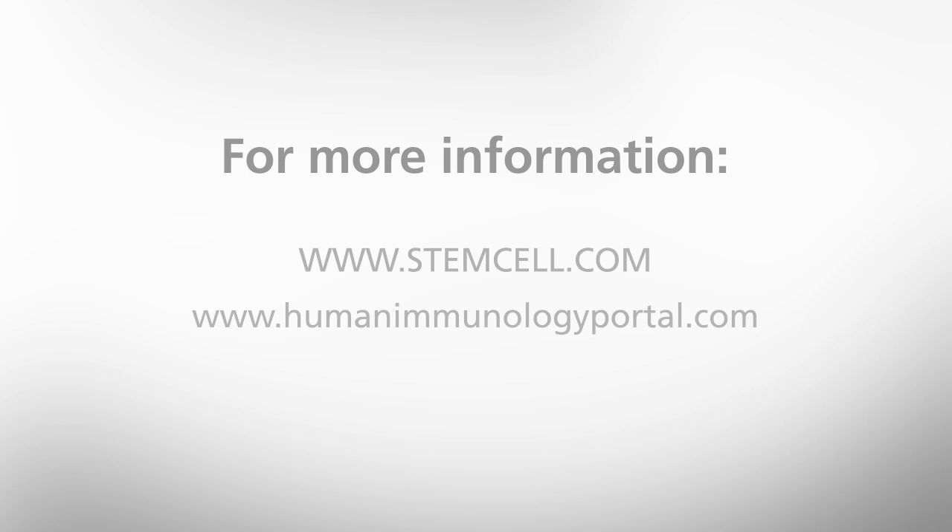You should now have a single cell suspension that is ready for cell counting and subsequent processing using EasySep to isolate your desired cells. For more information on preparing single cell suspensions from primary tissue samples and other procedures, please visit our website at StemCell.com.